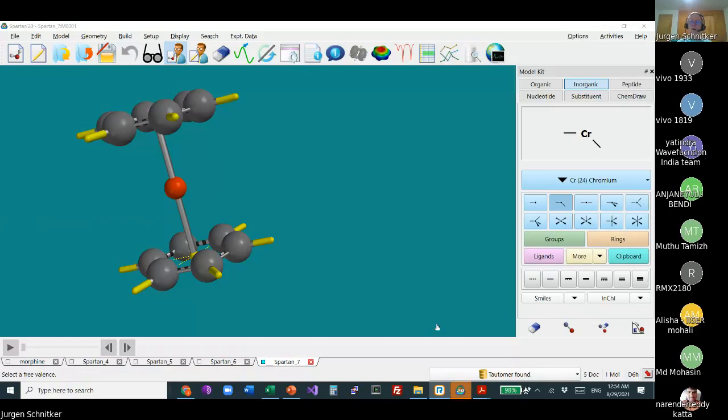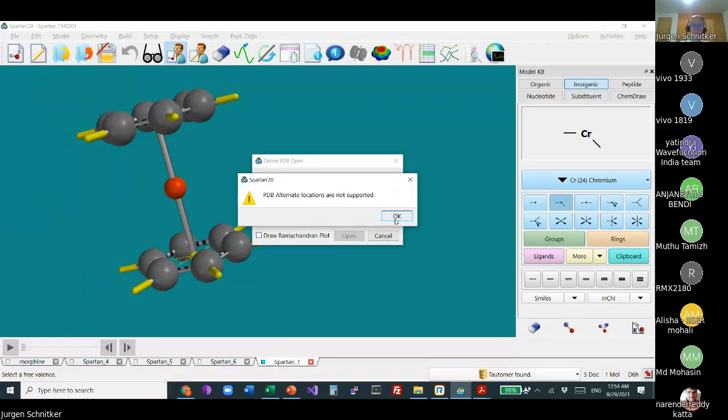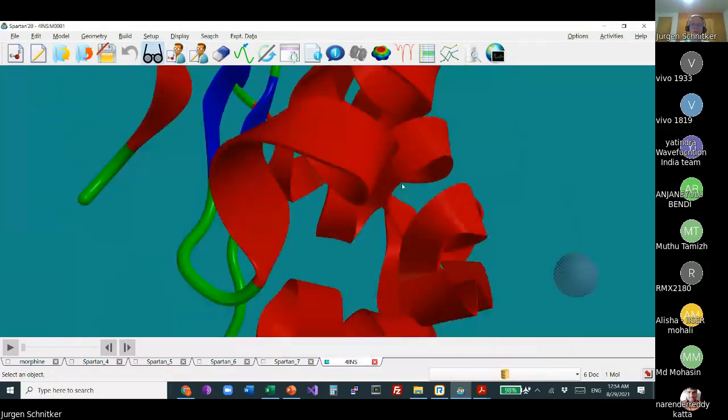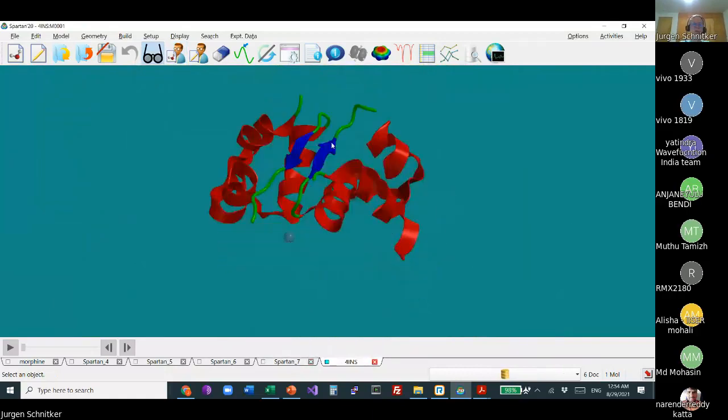Yeah. So let's start with biological molecules. You can retrieve them from the PDB database. Let me minimize my ring central. So I go to access PDB online. So here I just retrieved, on the internet, a structure from PDB.